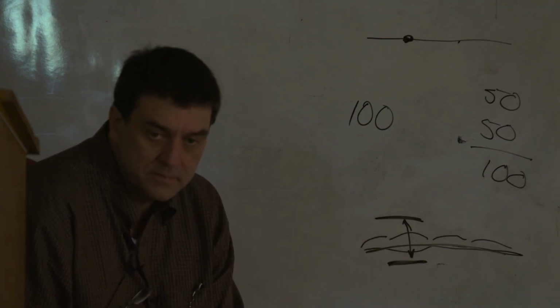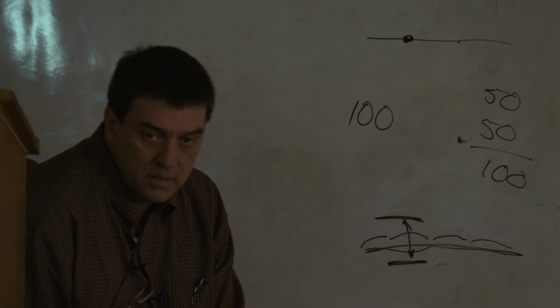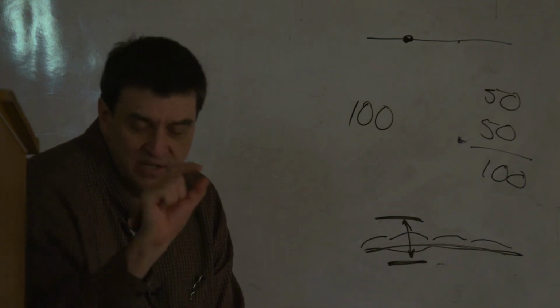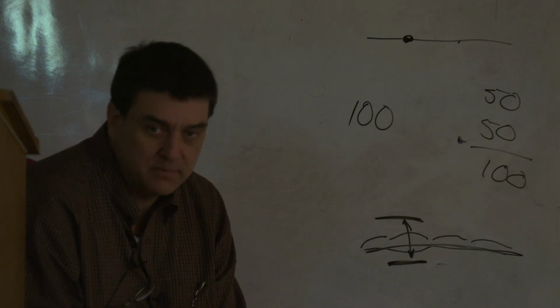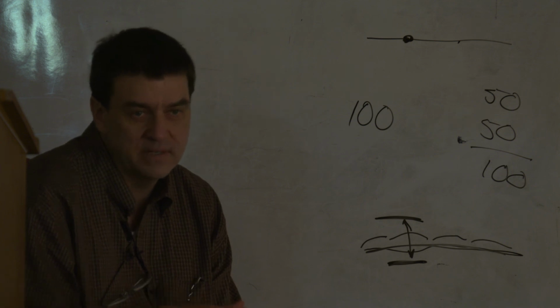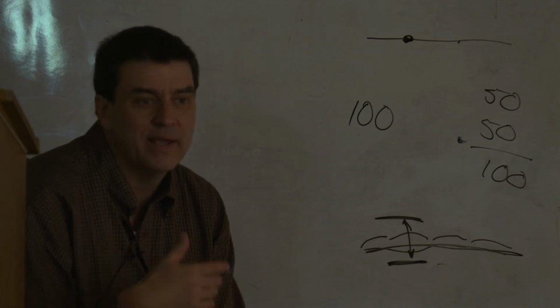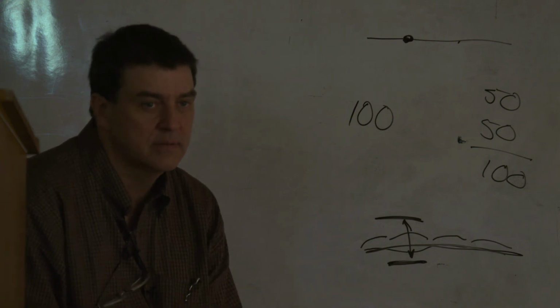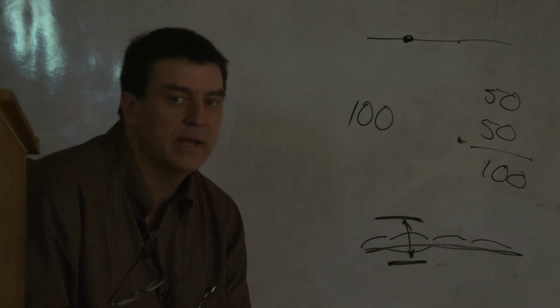And you said in the spinning disk there's a disadvantage, Z is a little thicker. Right, than the other. But if it's live cell spinning disk, the speed probably outweighs that difference in Z. Everything's a trade-off. Nothing's perfect. Any other questions?